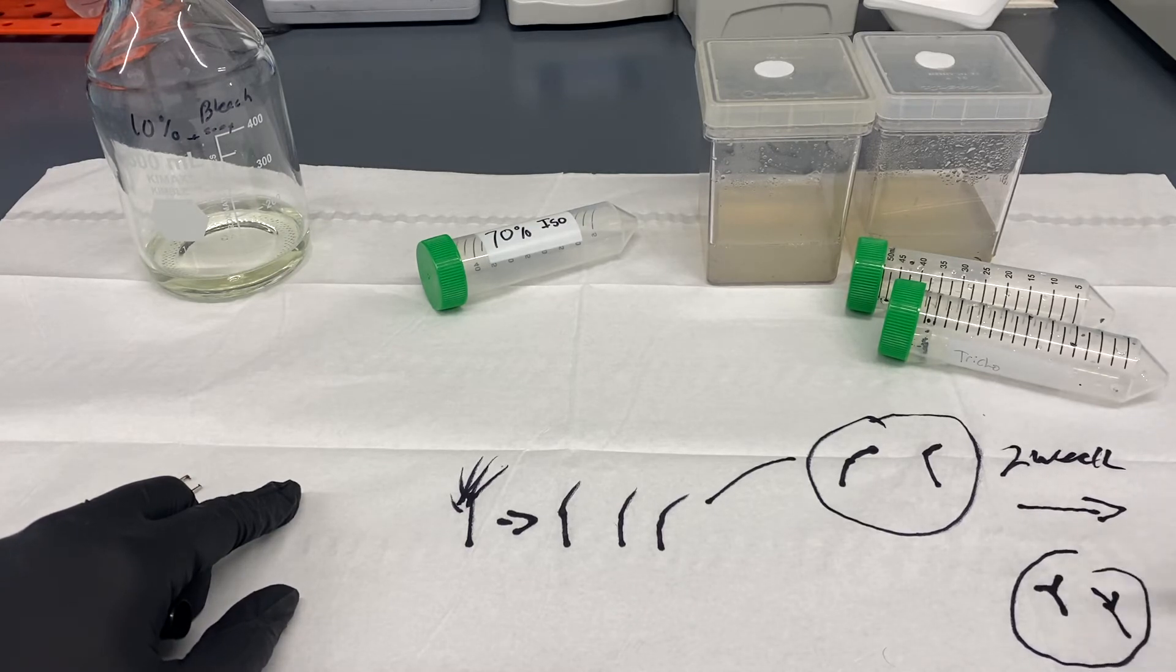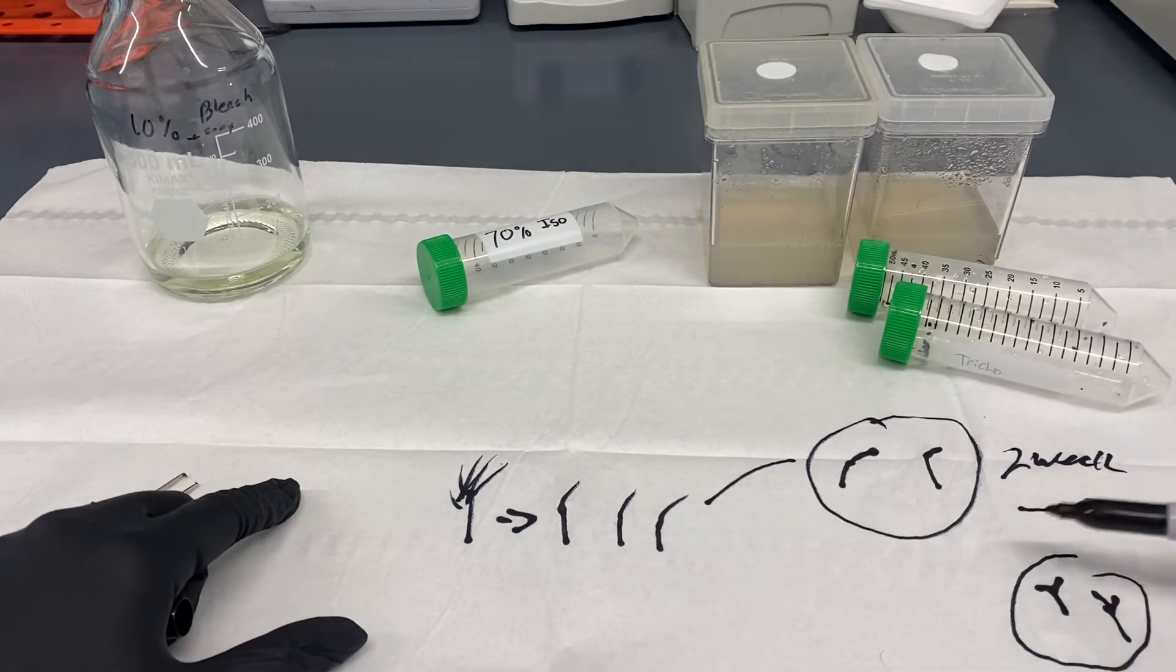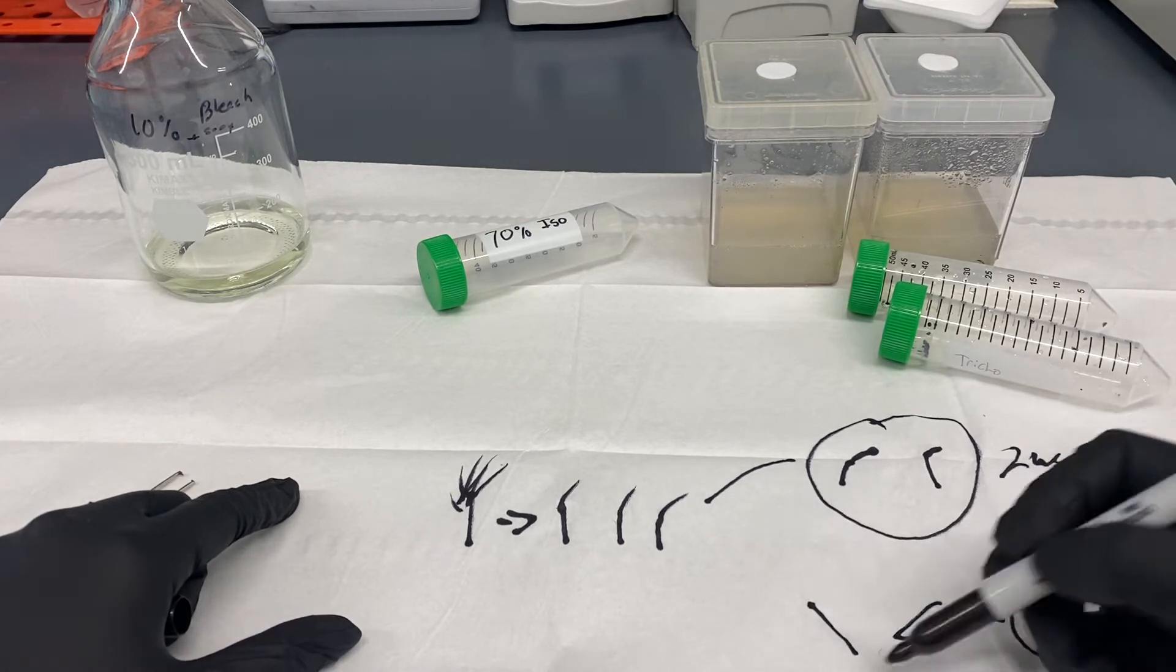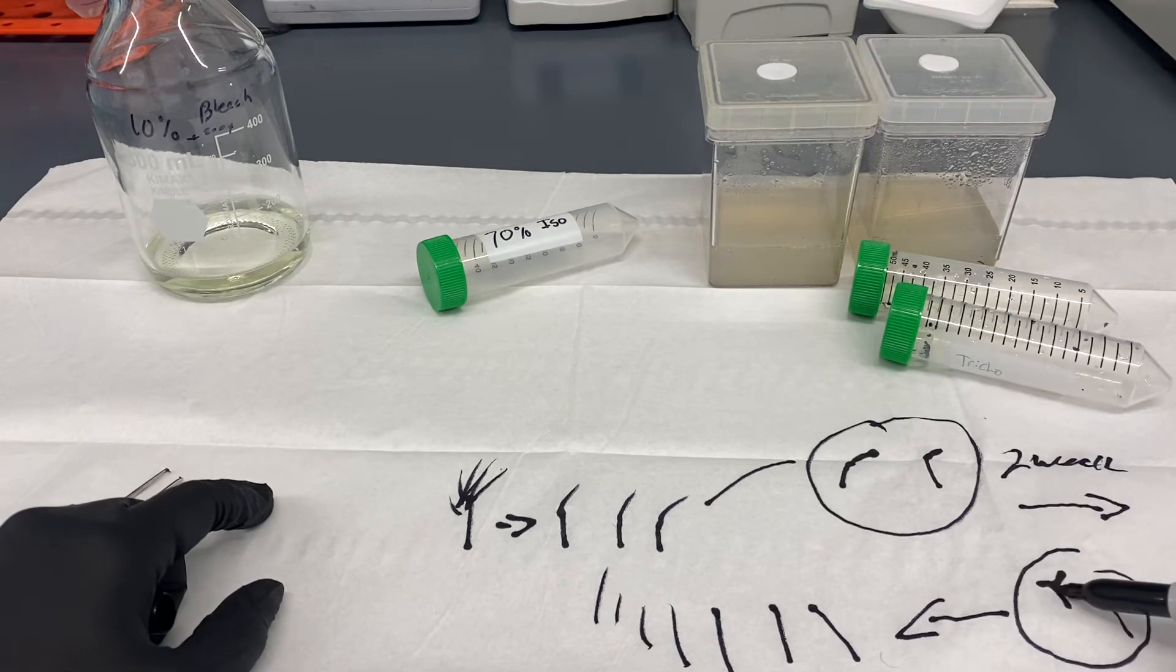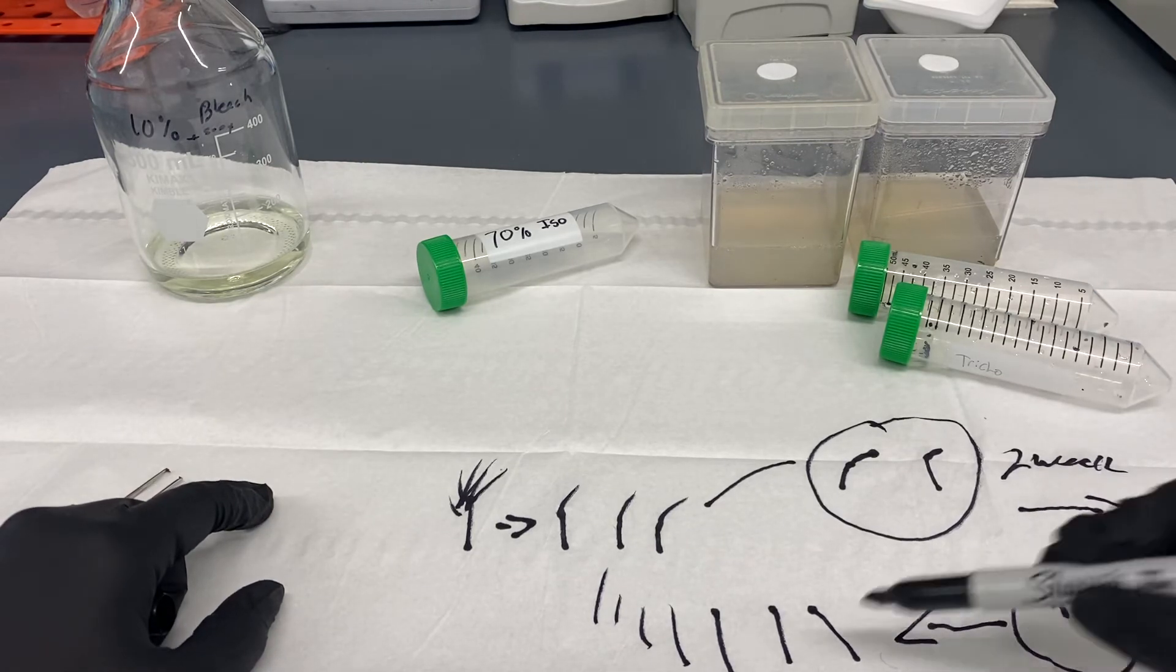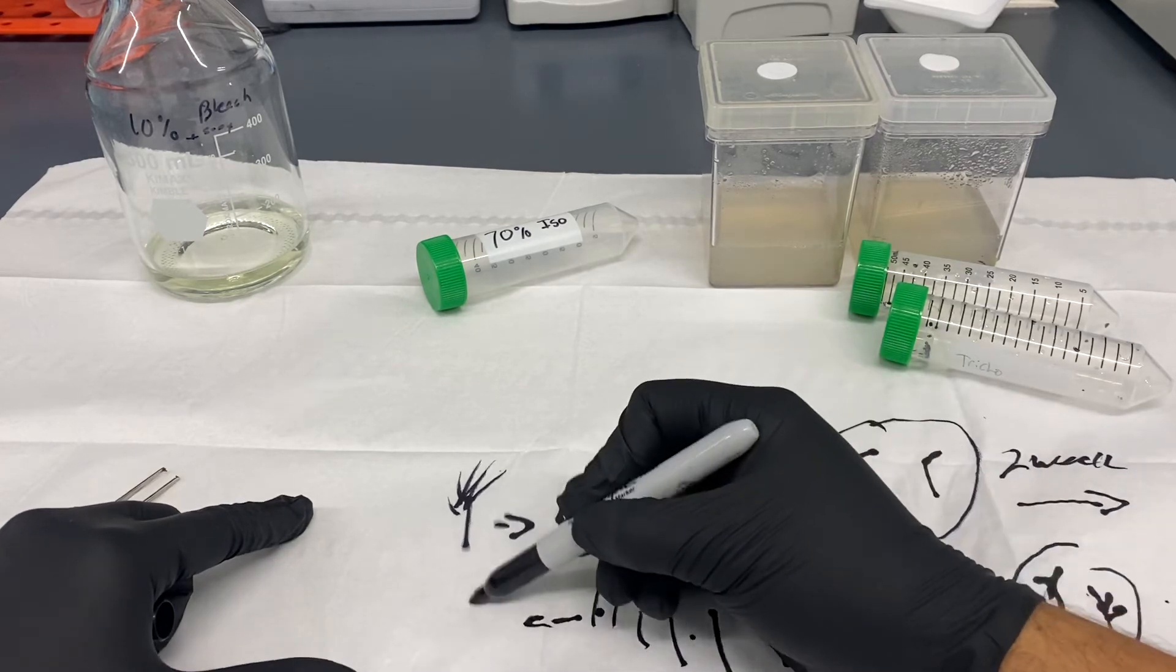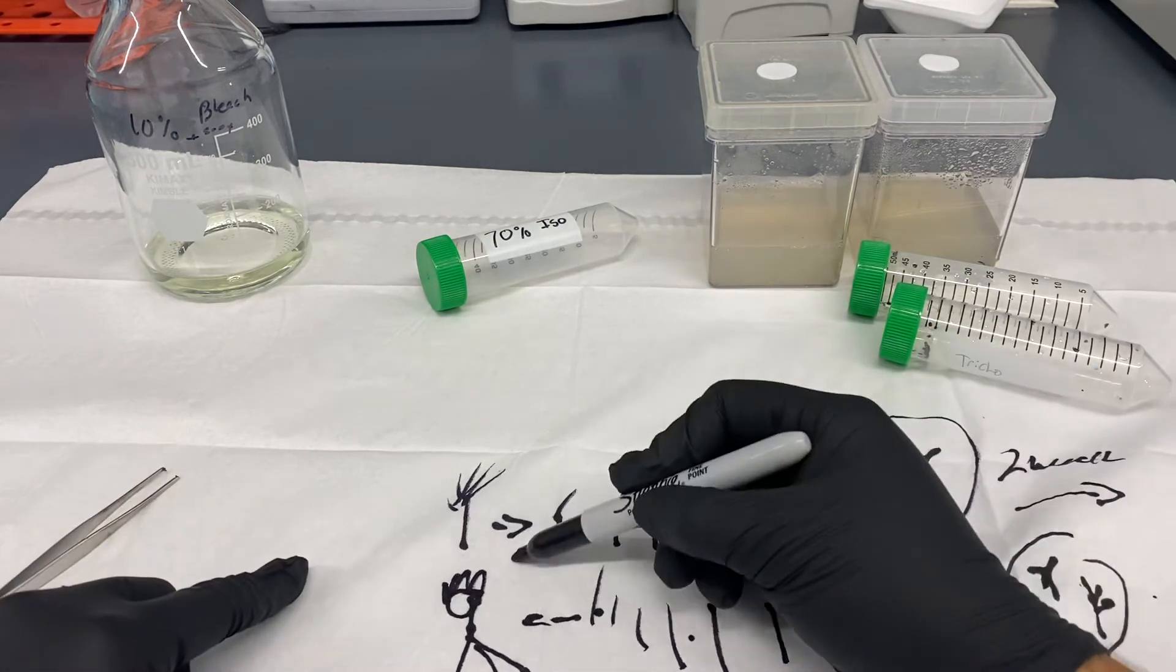Then after like two weeks you'll start to see the plant actually growing out more. I know these are bad drawings but that's pretty much what we're doing. So we're gonna take the plant, cut it up, put it on media. That media now has two, then I can cut that up and you can just keep expanding it. So you can see how it's exponential—I can keep cutting the new tissue into new tissue.